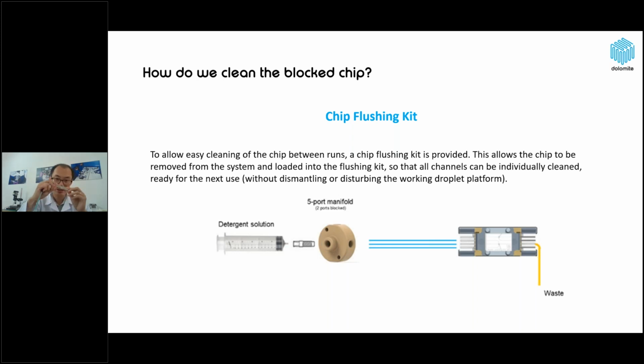Okay, so that is the demonstration part that I wanted to introduce, about how to make the chip flushing kit and how it can be used for flushing or cleaning the chip at the end of the day, instead of using the current system, or for resolving the chip when it is blocked during the experiment. It's a very simple, very helpful, very useful kit for cleaning.